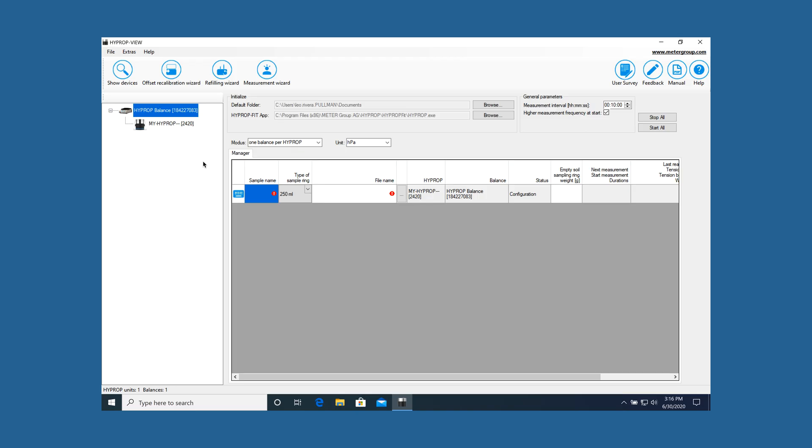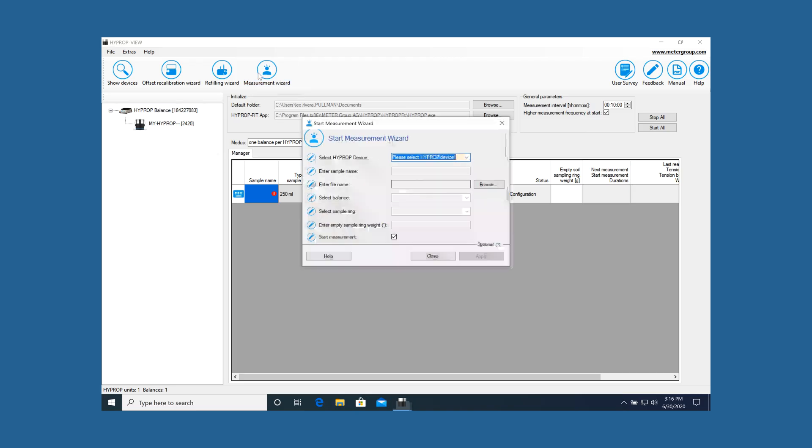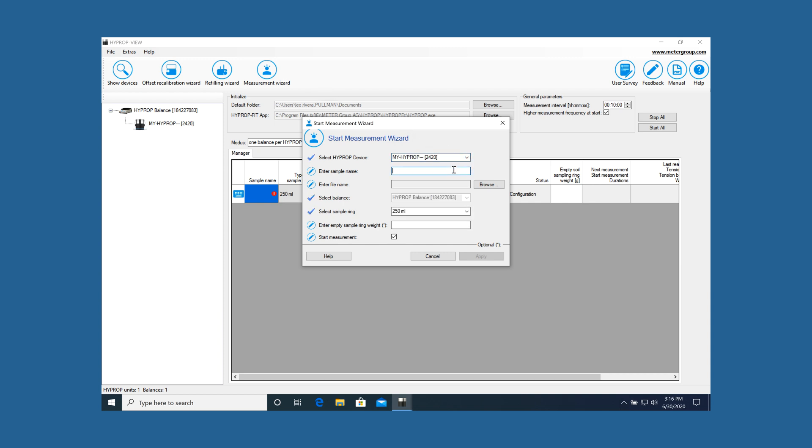To make a HYPROP measurement, click the measurement wizard icon. Enter the following data, either via the wizard or directly in the manager.